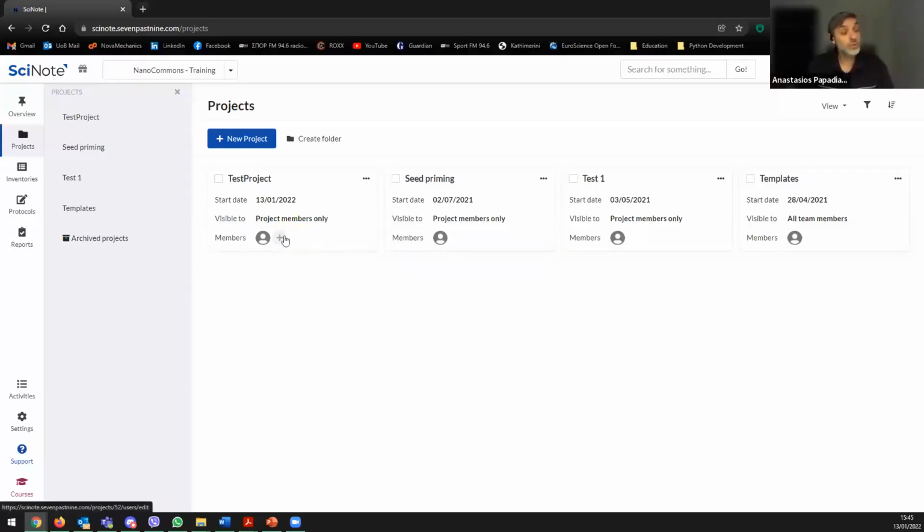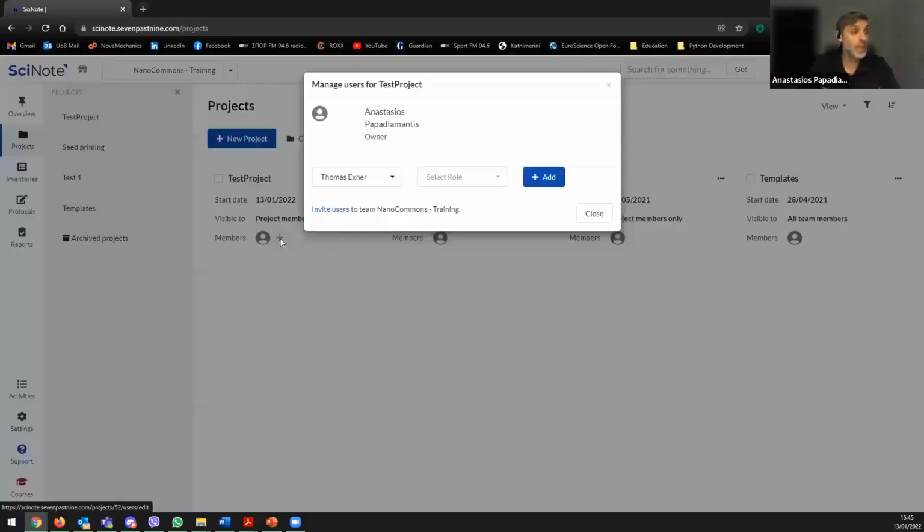If you want to add people to this project, all you have to do is click the plus sign here, and you can pick from the people that are here and then invite them to the project. So I will use Thomas here. I'm sorry, Thomas, for this.